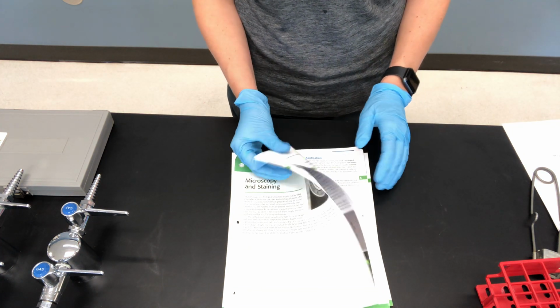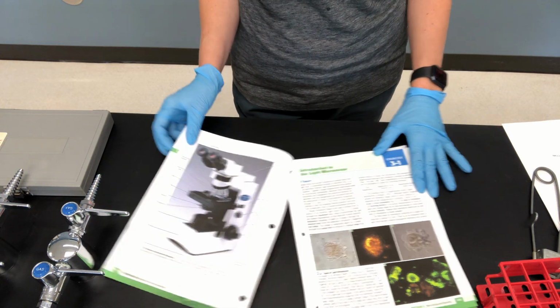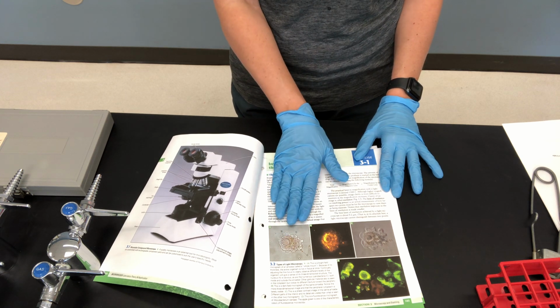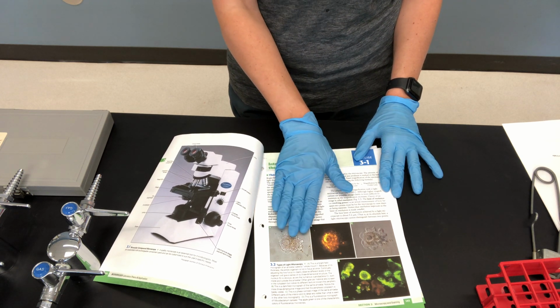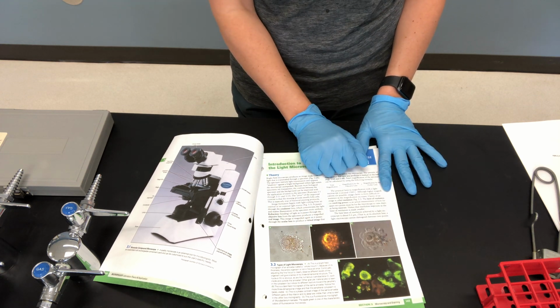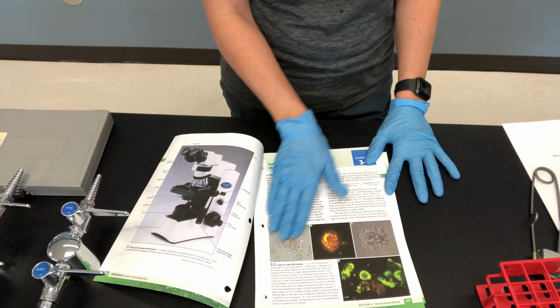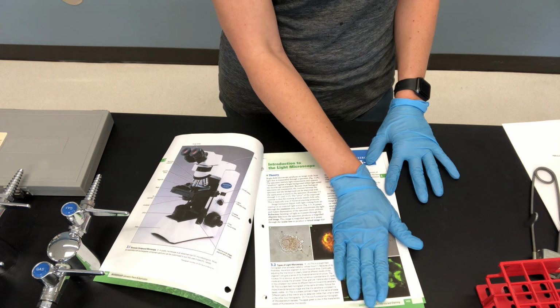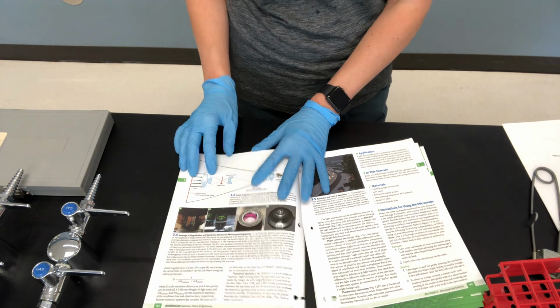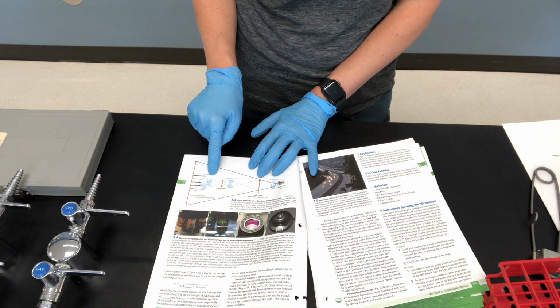So there's just a lot of introductory information about the parts and pieces of a compound light microscope, which is what we use in lab. Different types of light microscopy. So we use bright field, which means the background is illuminated, the specimen is usually dark or stained. There's dark field, phase contrast, and fluorescent microscopy. You'll be learning that in chapter 4 in lecture. But we use this bright field light microscopy. We do not have the filters to do these other techniques. It talks a little bit about the objectives and how microscopes magnify things with the curved lenses.